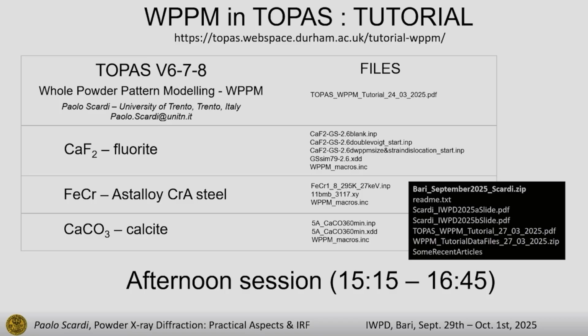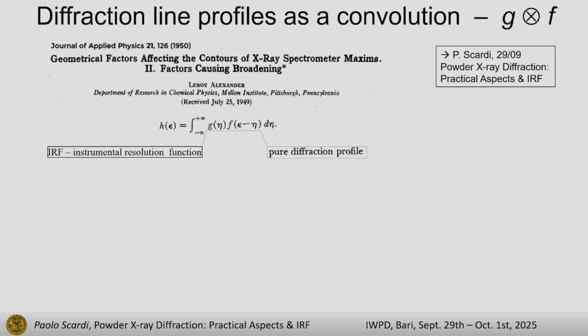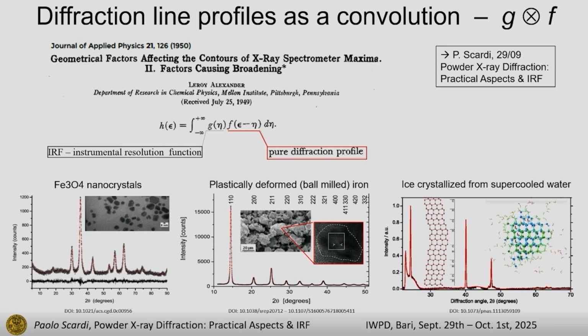the demo. Okay, so two days ago I showed you some practical aspects and how to handle the instrumental resolution function. Then after this talk on the IRF, there was the session given by Robert Dinnebier. I think he showed how to do things in practice using Topas. And so I'm not going to talk about the instrument anymore. That's given. So we will focus more on the other part of the contributions to the line profile.